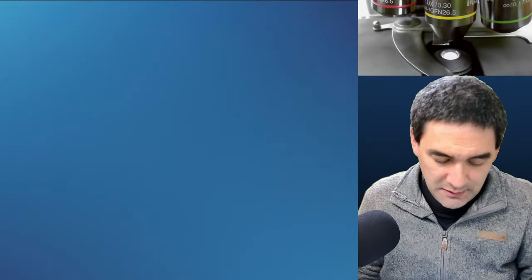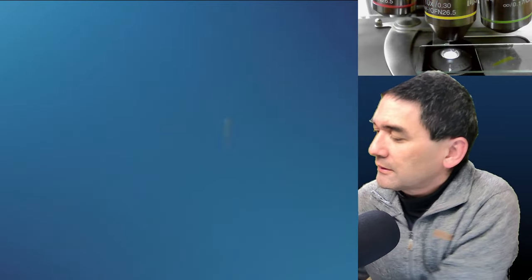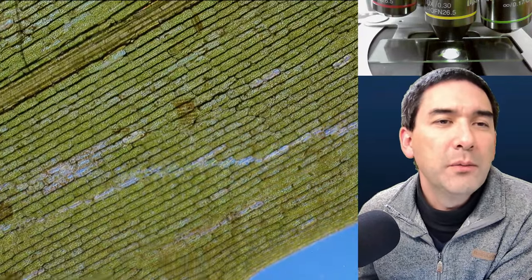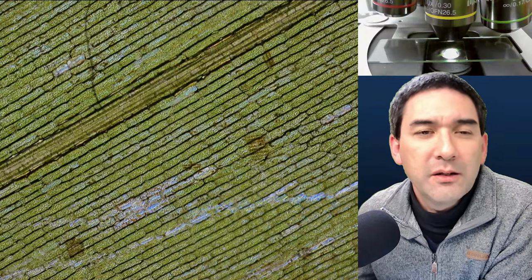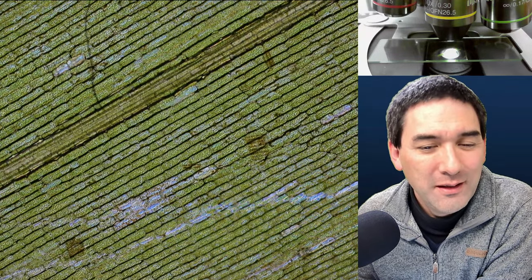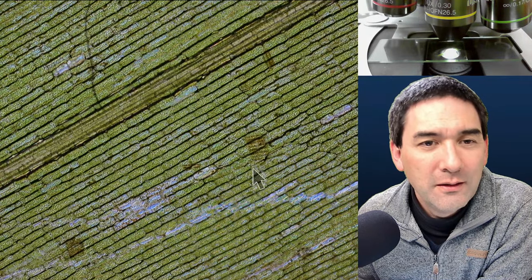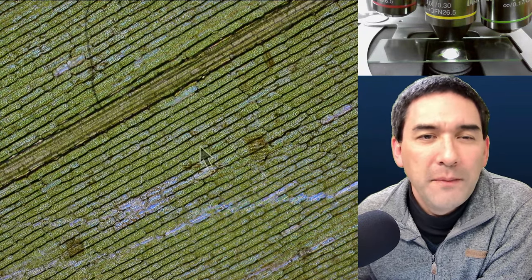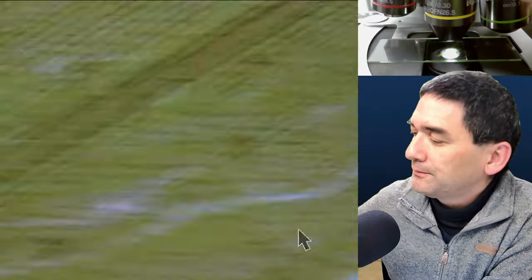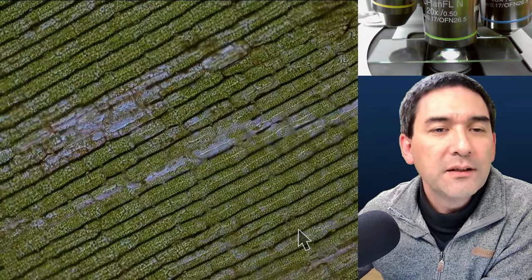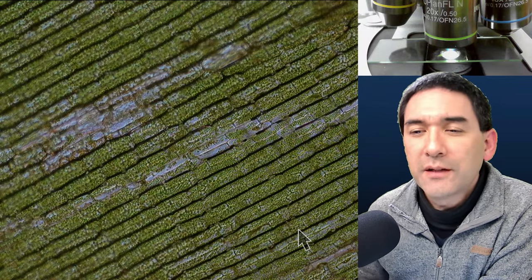At low magnification it doesn't look very interesting, but you can see the individual cells. Interestingly, there are not only cells of the Egeria on here — there are also a couple of other organisms. Have you spotted the diatoms? Diatoms are algae — yes, there are diatoms here. Going up in magnification, you can see those tiny green dots, which are the chloroplasts, and they're quite fascinating for several reasons.